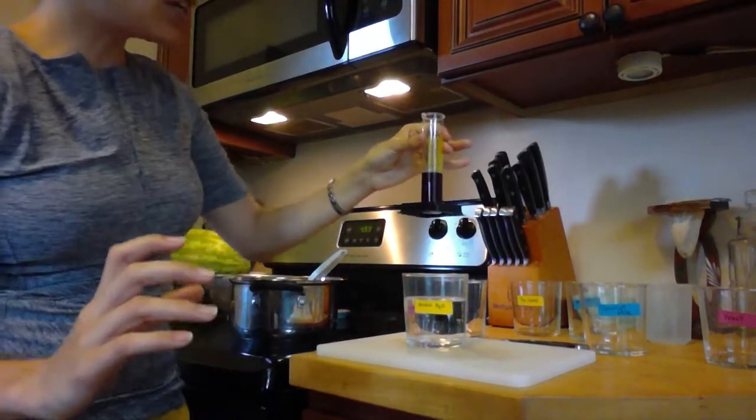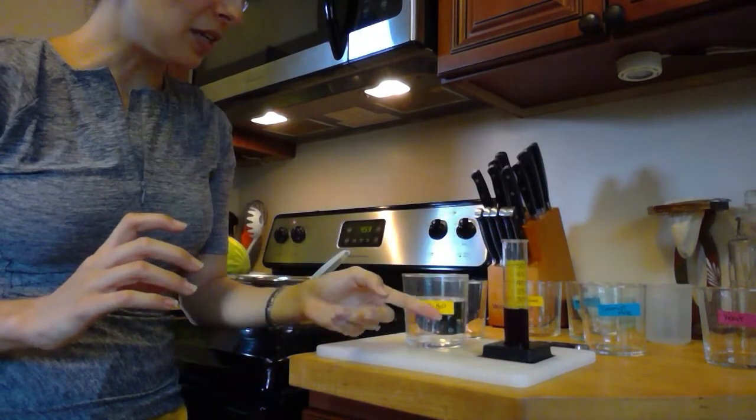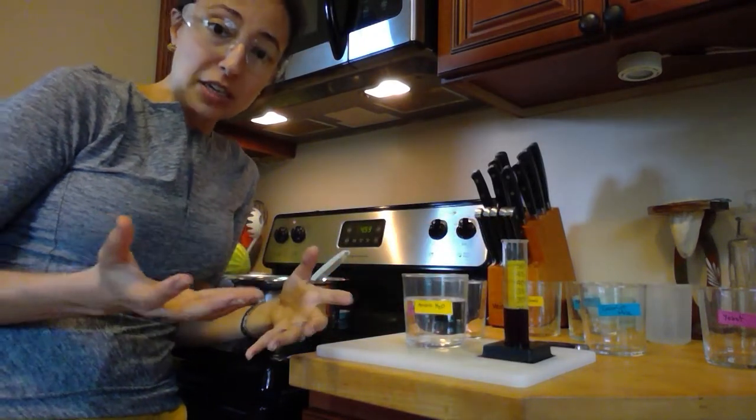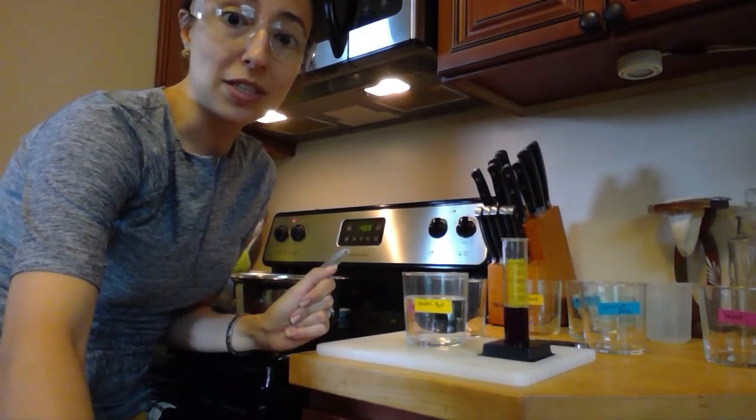And I want to make a prediction or a hypothesis on what's going to happen. So do I think that my acidic water is acidic or basic? Well, I'm hoping it's acidic, right? That's what it should be. We'll see if that's actually correct.